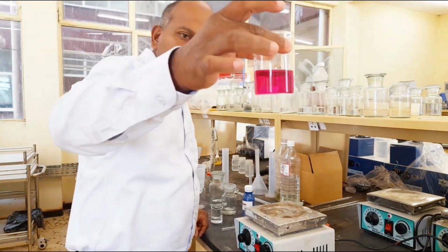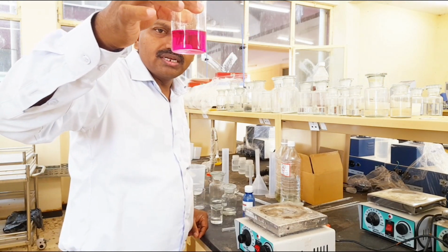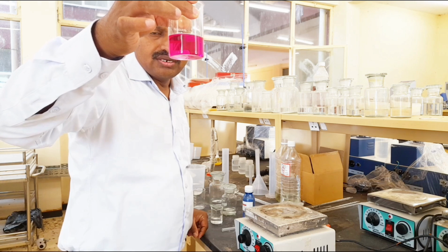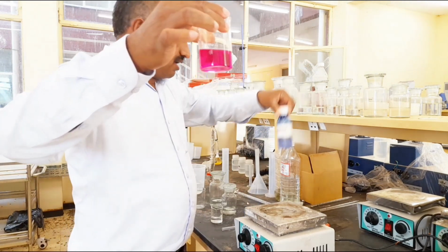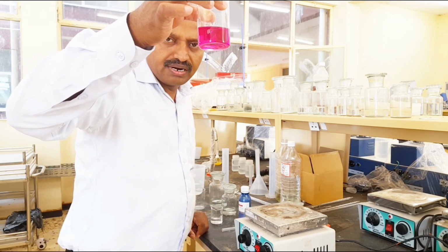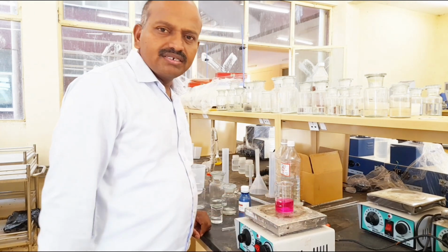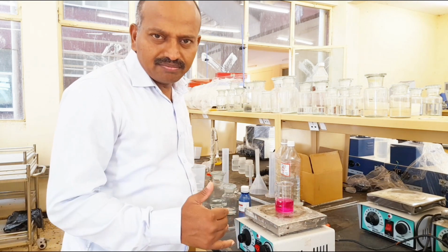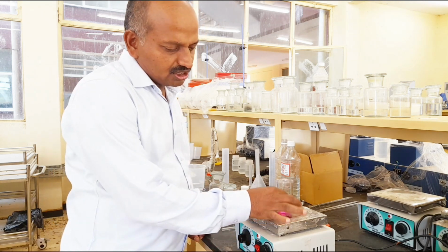So this is the mixture, sodium chloride, sodium hydroxide plus water. All three are colorless in solution. The phenolphthalein indicator is also colorless. When we add it, it turns into a brilliant pink color. The reason is that phenolphthalein in a basic medium exhibits pink color. That is why the solution is pink.